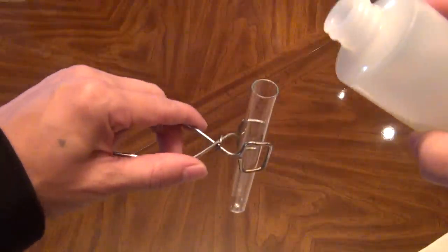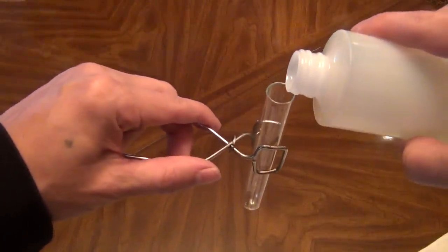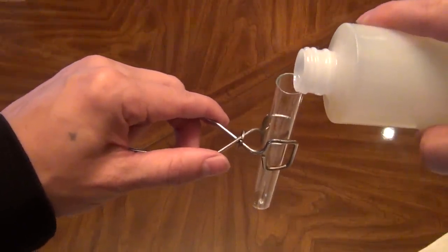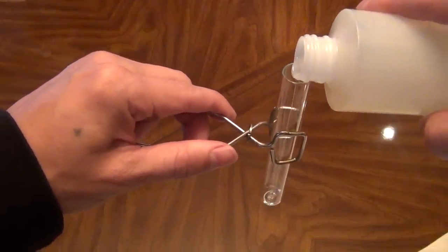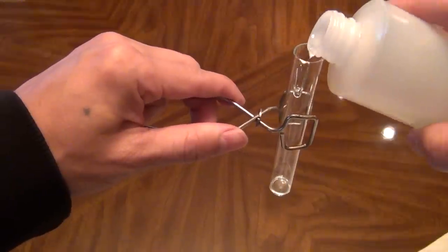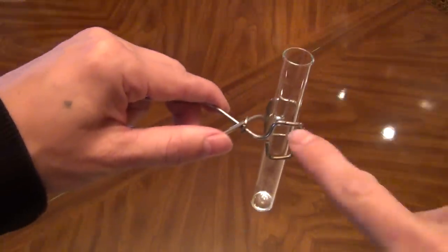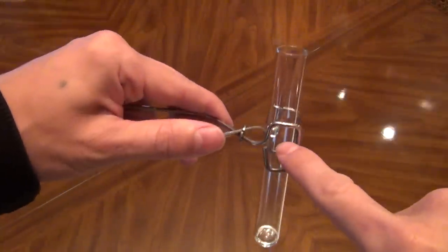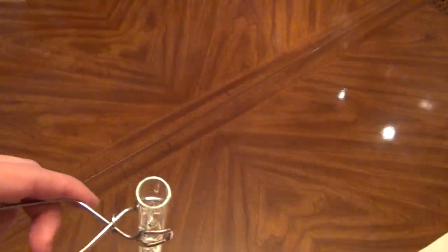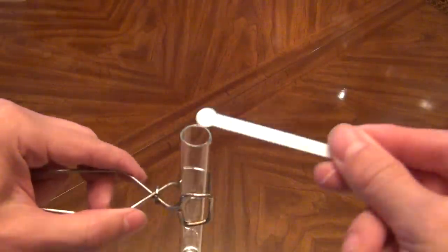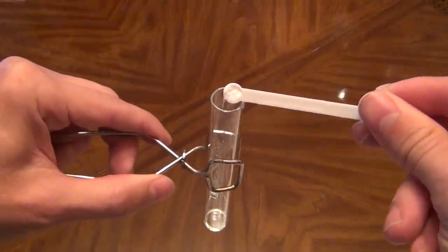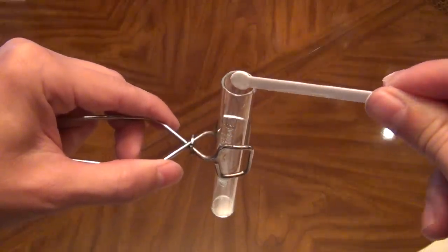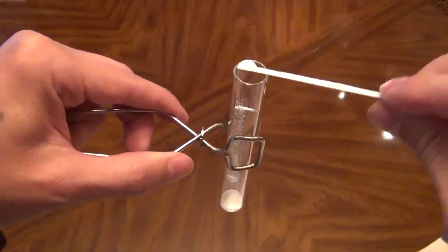First of all, take a test tube, add polysorbate 20, a little bit in the bottom. Try not to get it on the side like I just did. Then take your triacontinol, your desired amount, and pour it in there. See the problem - if you get it on the side, the triacontinol sticks.